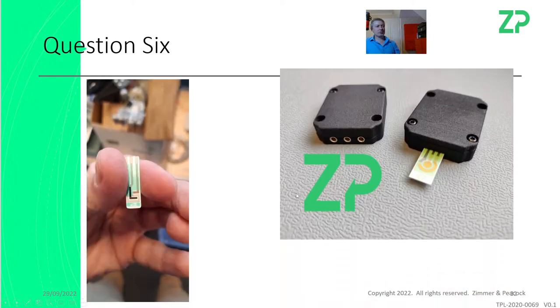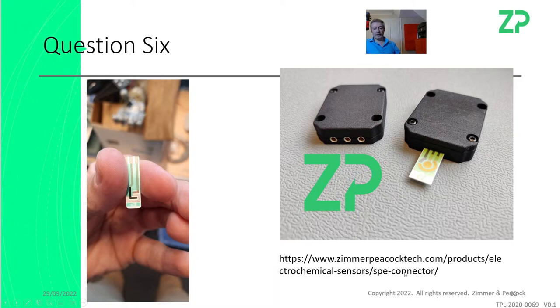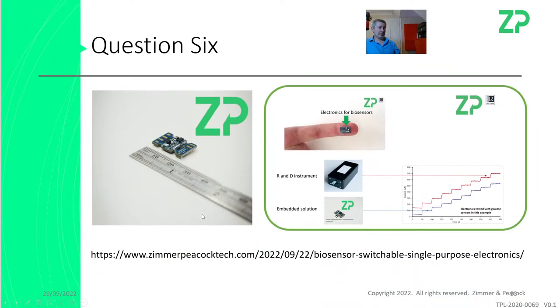Just a side comment for anyone: we do have these connectors as well. If you're working with any of our sensors or our hypervalue electrodes, we have these quite nice adapters that allow you to click in banana plugs in the backside there. Just make a note of that. If you can't make good electrical connection, nothing's going to work. It's all going to be terrible.